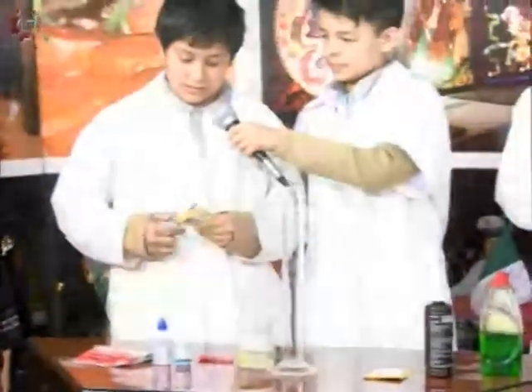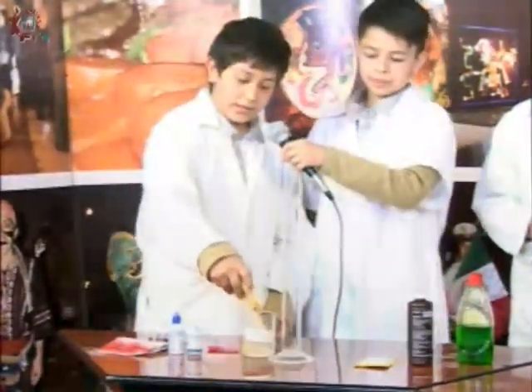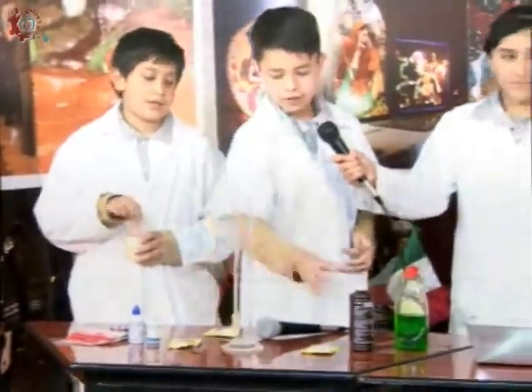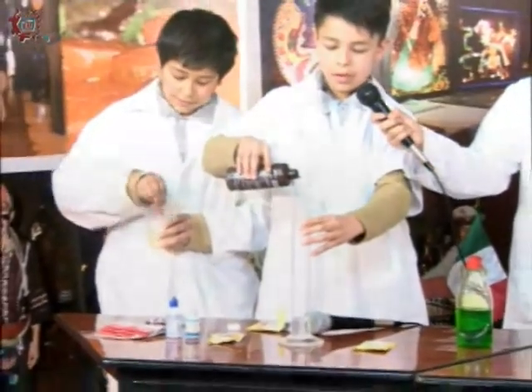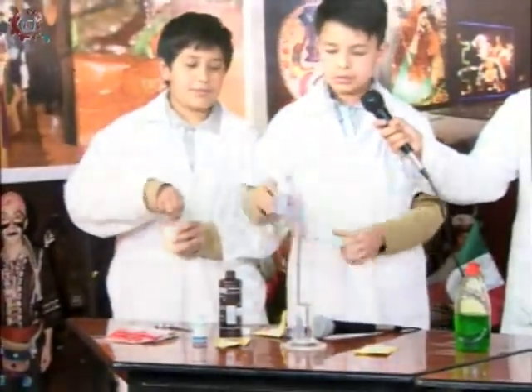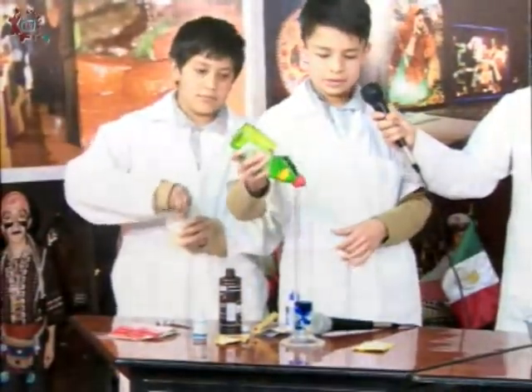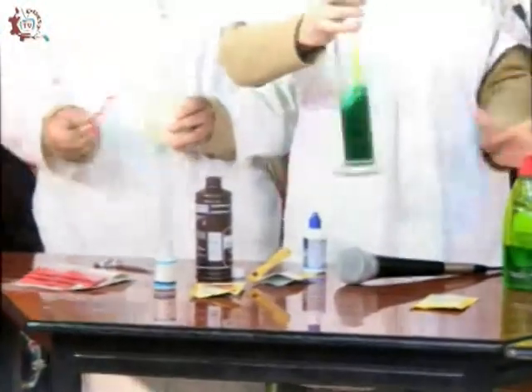Esta reacción también es una reacción exotérmica, es decir, que se calienta. La probeta es donde vamos a echar. Vamos a mezclar y, en lo que mi compañero acaba de mezclar, vamos a echar el agua oxigenada, el colorante y el detergente, y lo vamos a disolver, a revolver.